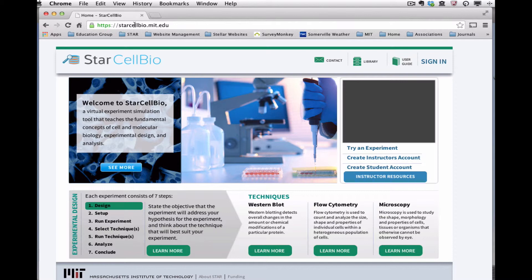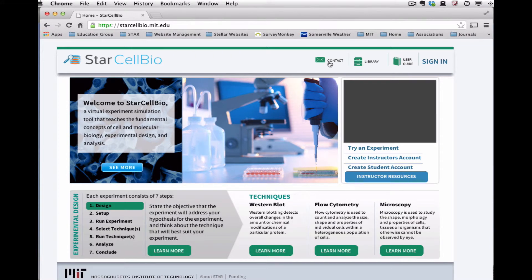Now you're on the StarCellBio homepage. The homepage provides an overview of the StarCellBio program and the types of experiments that are simulated within the program. Also on the homepage are links to contact the StarCellBio development team to report a software bug or provide feedback.